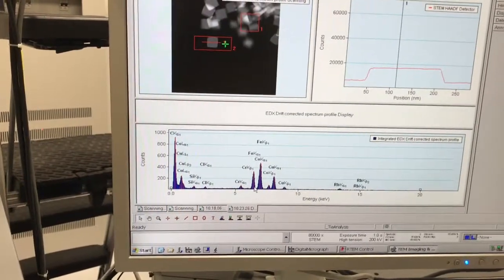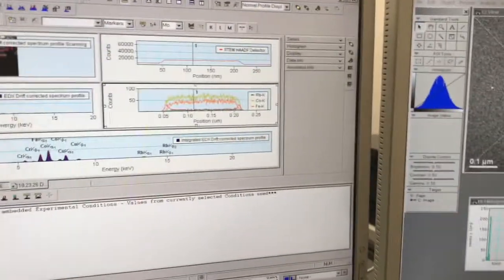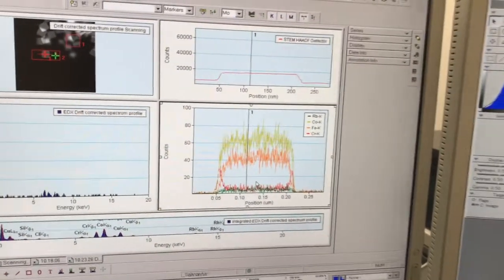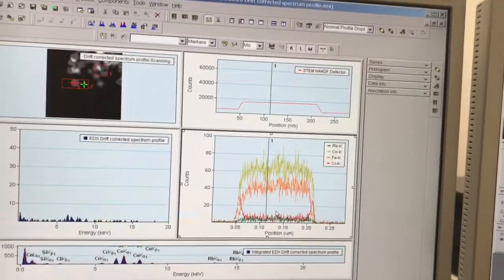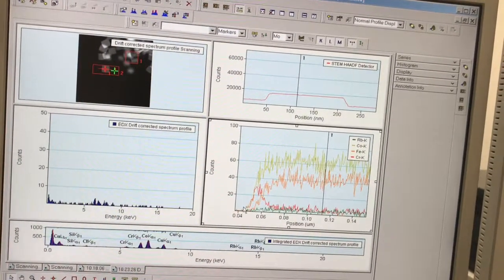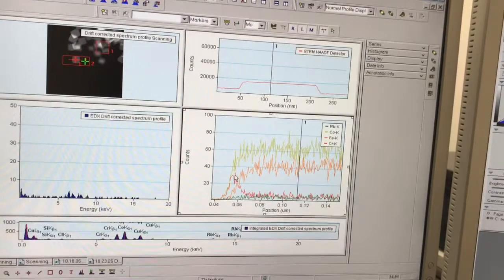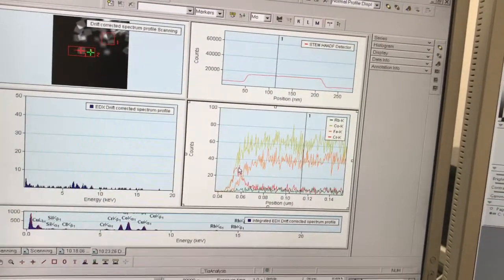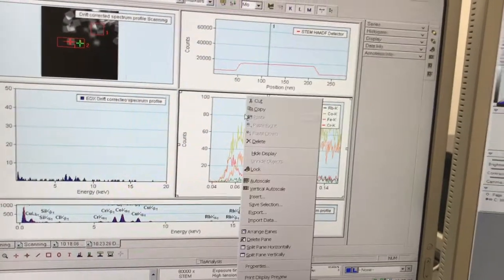Click on the blue part of the spectrum, come up to Components, Auto Map, and then Generate Output. I can see my line scans for the four elements. I can expand this for a better view. The red is chromium — I can see an increase in the chromium signal at the edge of the particle right where the shell is. The shell is chromium-rich, which I knew ahead of time, but now we have analytical proof of this from the spectrum profile.